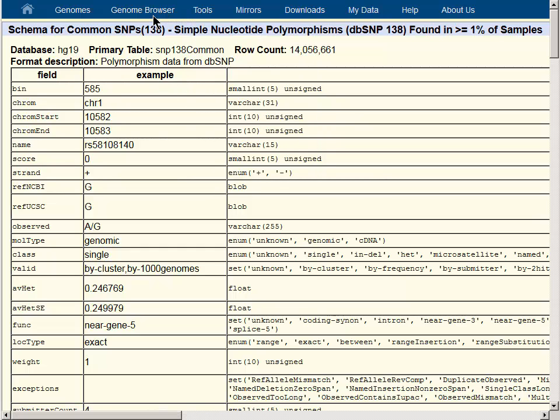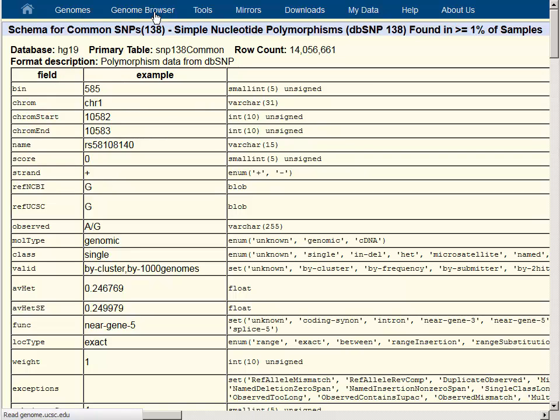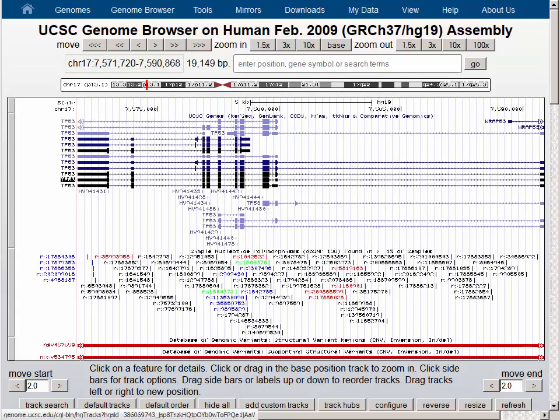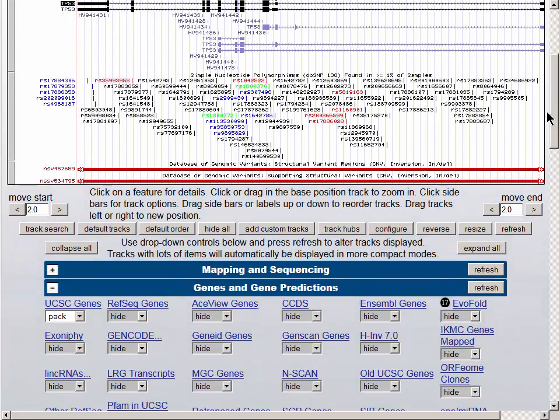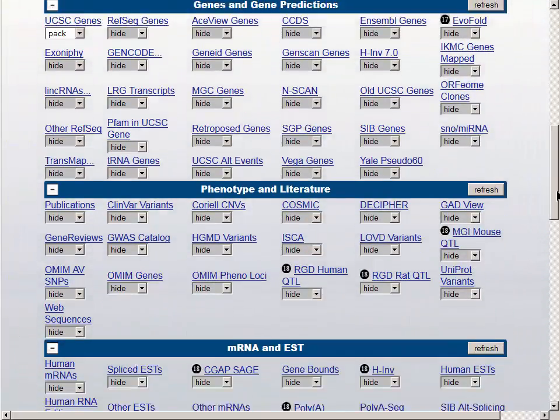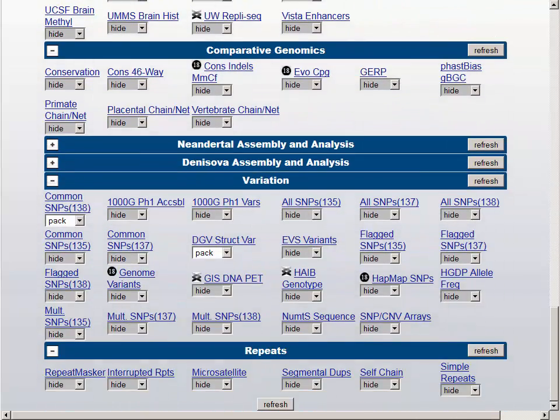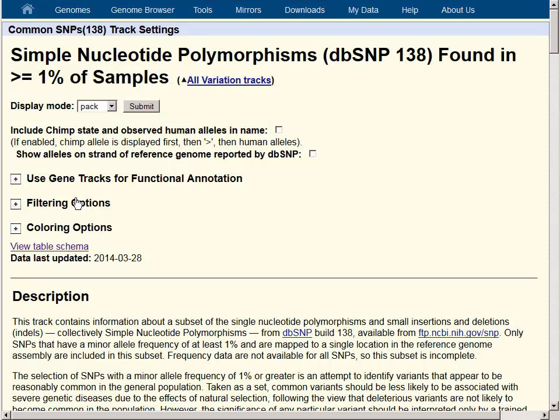Going back to the Genome Browser using the navigation bar at the top of the page. If we scroll down the screen to the track controls, we find that if we click into the link above the track control, it takes us to the same page as does the mini button next to the data track. This has the advantage that you can click into one of these track controls without having to actually turn the track on.